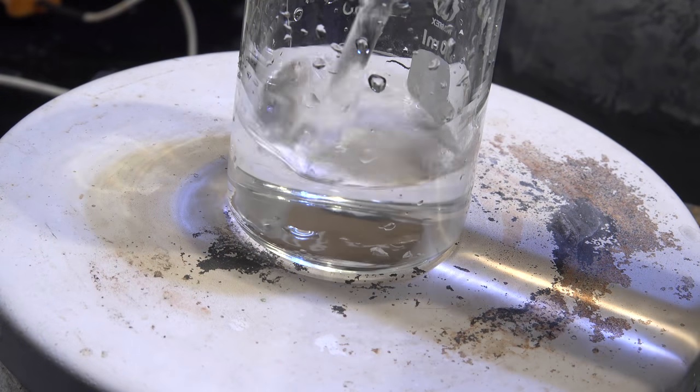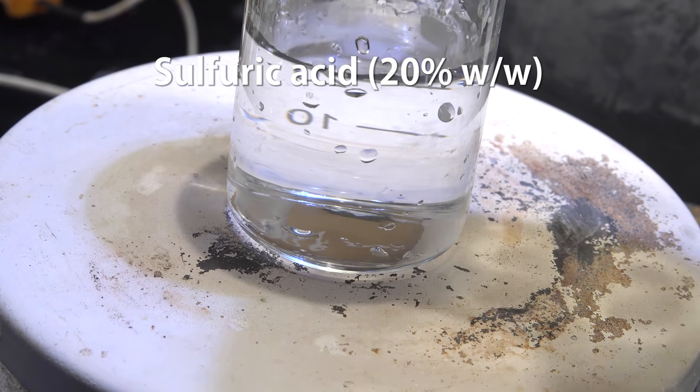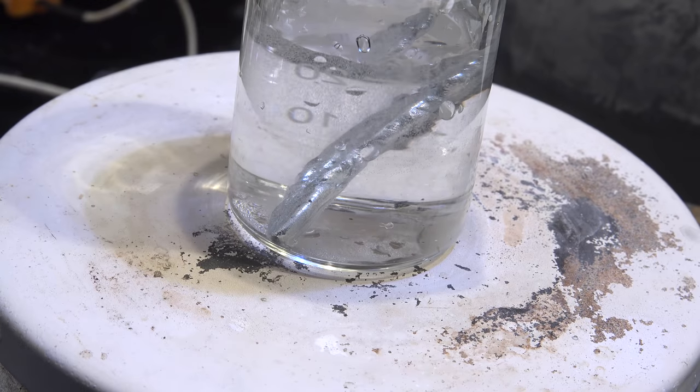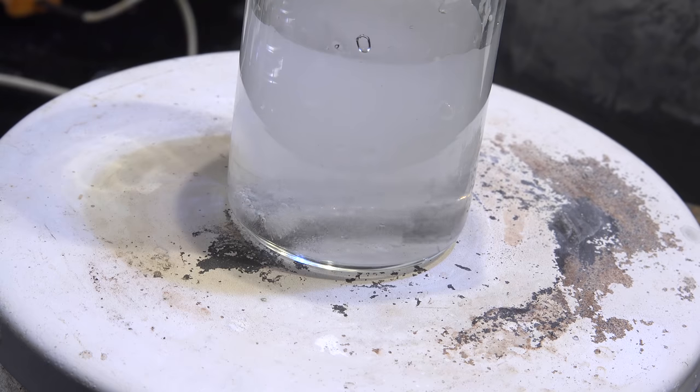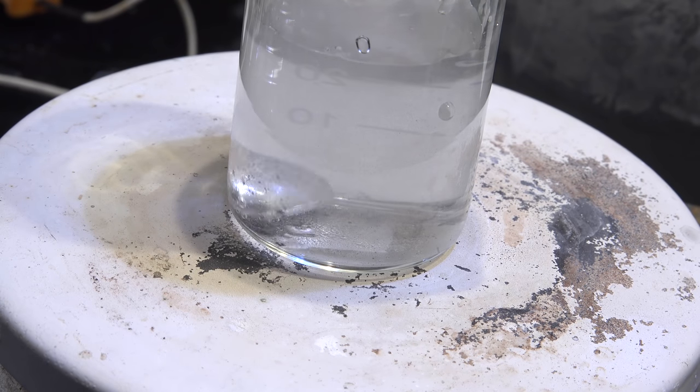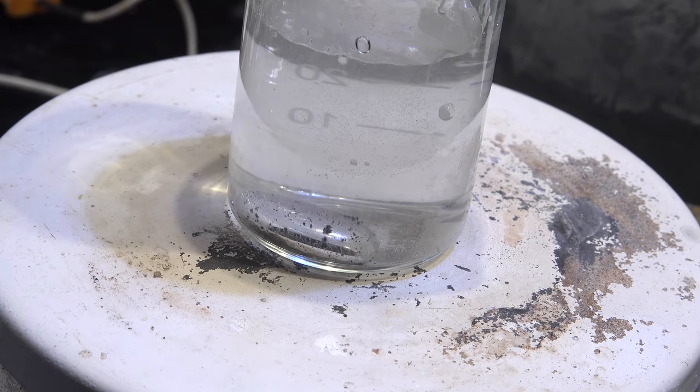If you want to clean it up a bit more, you can get a 20% solution of sulfuric acid. Heat it up and add the gallium so it liquefies. The acid reacts with the oxides and helps clean up the gallium. The drawback of this method is that it consumes a small amount of the gallium as well, so it shouldn't be used for primary purification — just as a means of cleaning up the gallium.